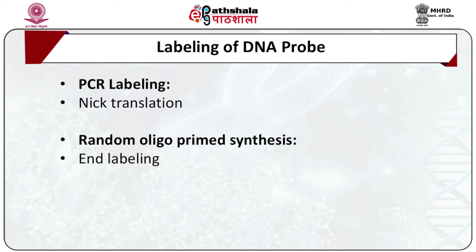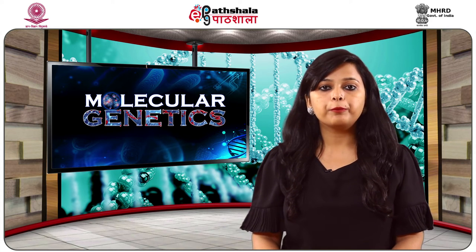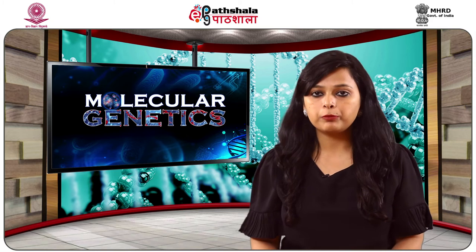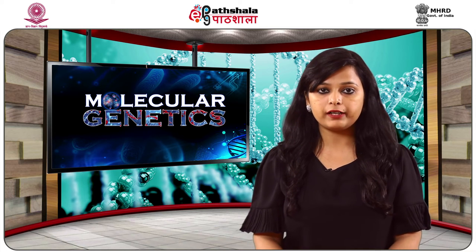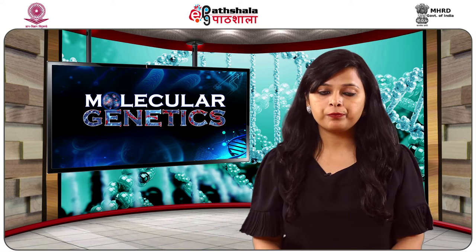Let's talk about labeling of DNA probes, that is, how DNA probes can be prepared. For labeling of the probe, one of the four nucleotides is first labeled either radioactively or non-radioactively and then is incorporated into the probe using any of the following approaches, like PCR labeling. This is one of the simplest and most common approaches of incorporating labeled nucleotides into the probes. To begin with, the designed primers are used to amplify the probe, the sequence of the gene of interest, and during amplification, one of the labeled dNTPs is easily incorporated into the probe.